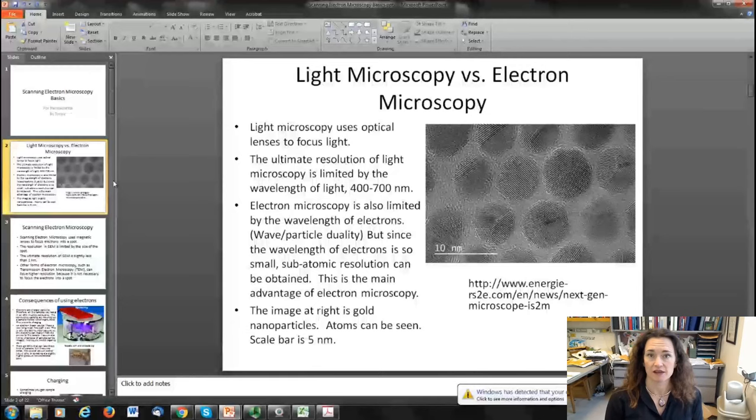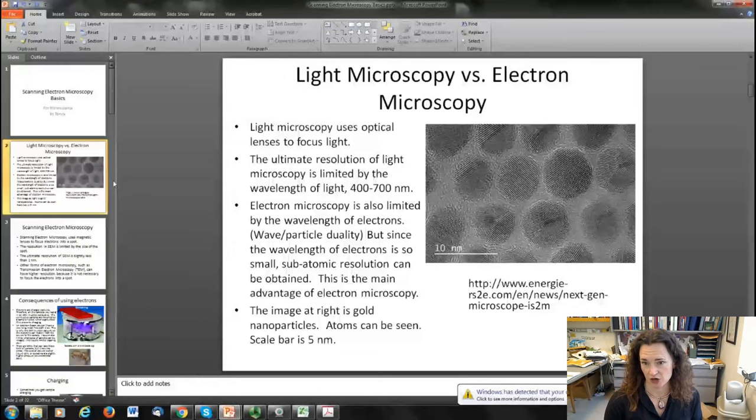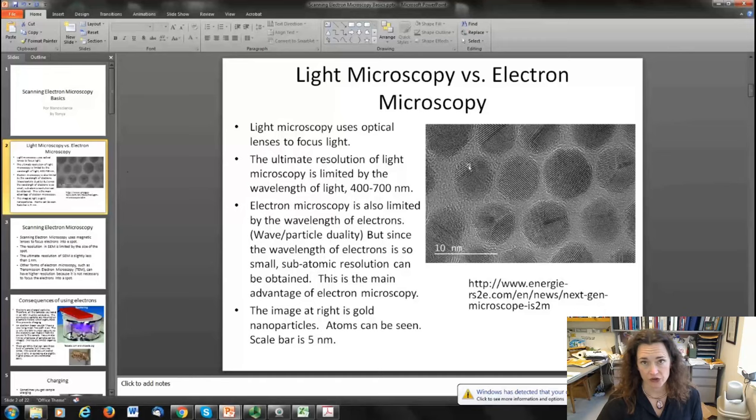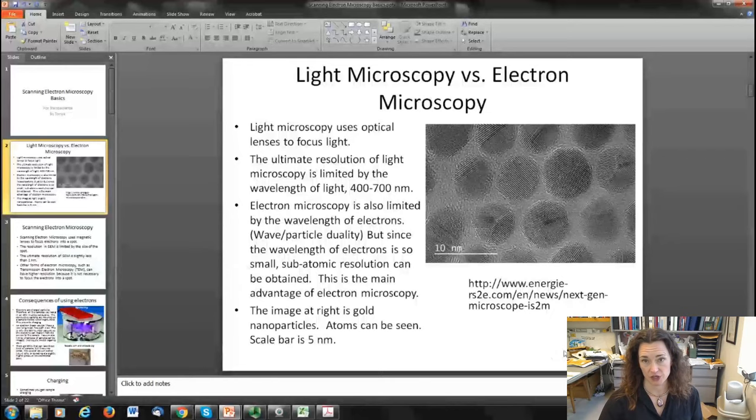This is the main advantage of electron microscopy — it can see things that light microscopy and many other forms of microscopy just can't. That's illustrated here by an SEM image of some gold nanoparticles. Each one of these gold nanoparticles is about five to ten nanometers in diameter, and if you look closely at the electron microscopy image, the little dots are actually the atoms in the nanoparticle. This was taken with a transmission electron microscope.